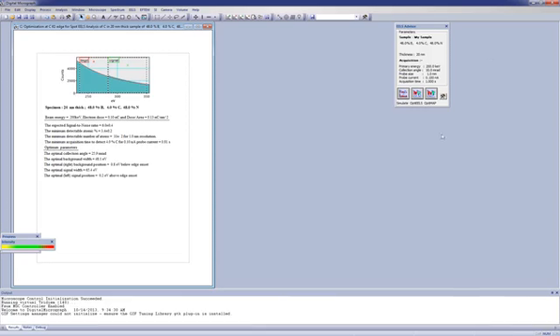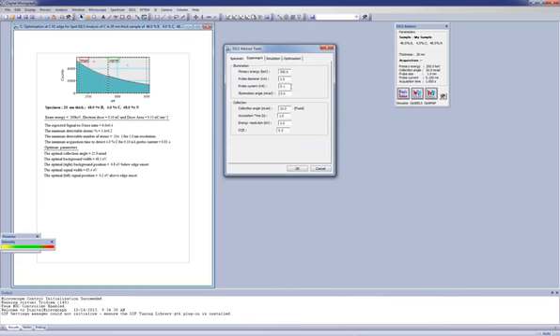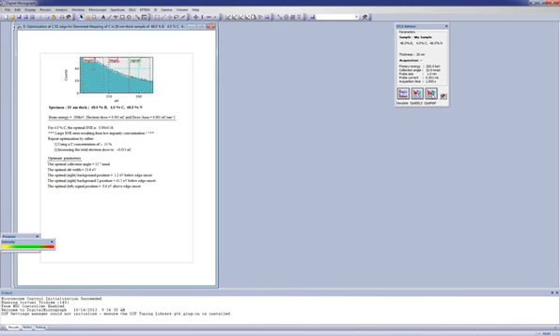So once again, we can go back to Digital Micrograph. We can specify the parameters here, and in this case, we will typically be having a much smaller probe current because it's essentially the probe current per pixel. So typically, we'll have something like a picoamp. And in that case, we can hit OptiMAP, and it'll go through the optimization for that edge and come up with an answer.